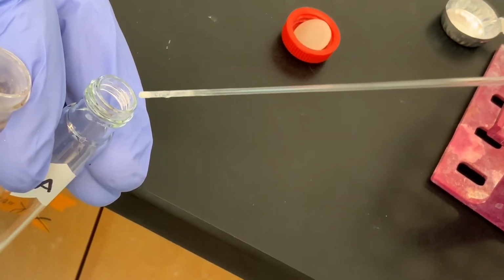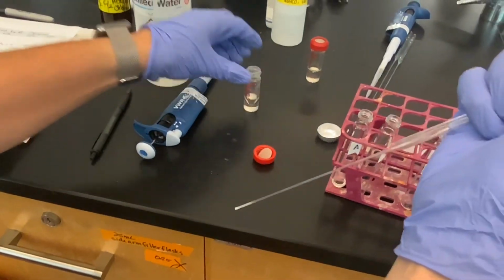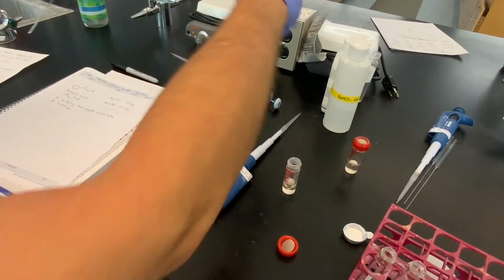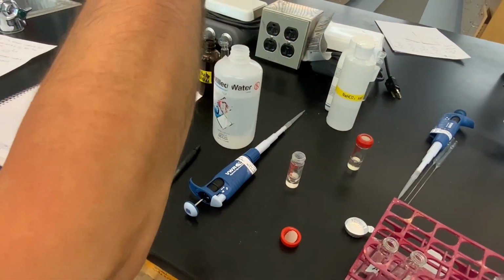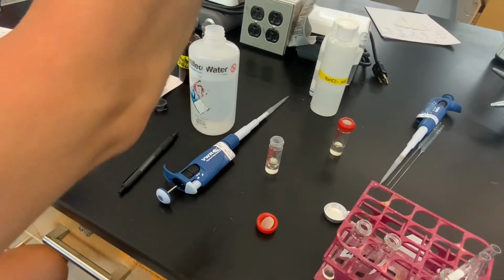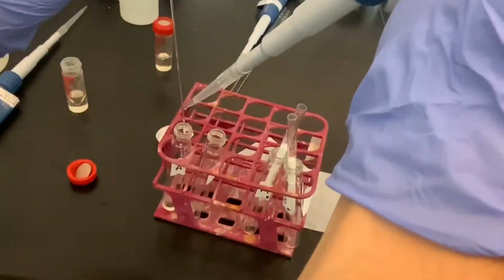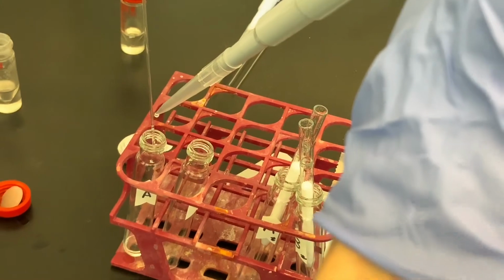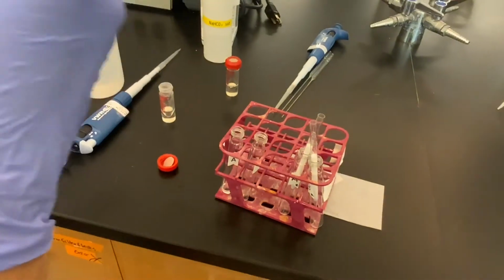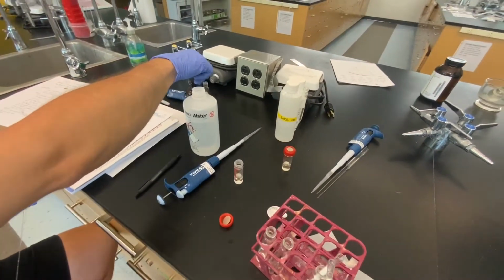If you were to perform this here, you wouldn't necessarily have the time to do this, but I'm just going to take a little bit of methylene chloride and rinse the pipette tip, because I want to be sure that I've got a nice quantitative transfer here. So I'm just rinsing the tip of my Pasteur pipette, so I've got all of the benzoic acid that was originally dissolved in it transferred over to our first culture tube. But that's extra.